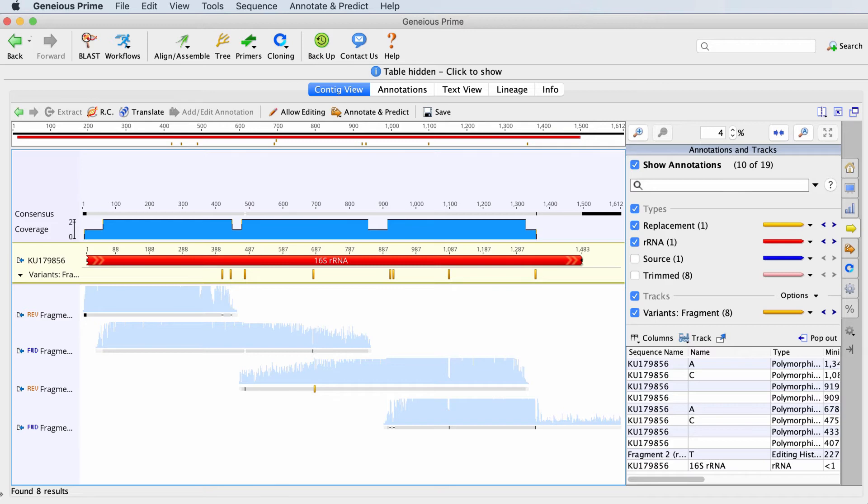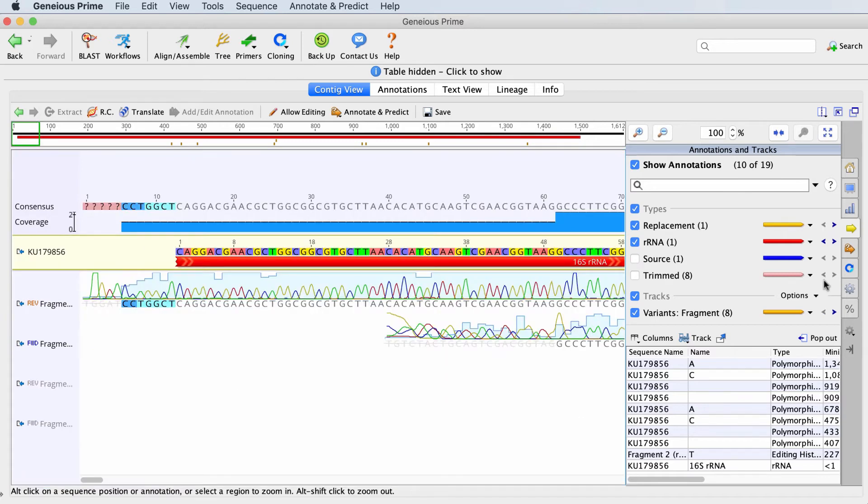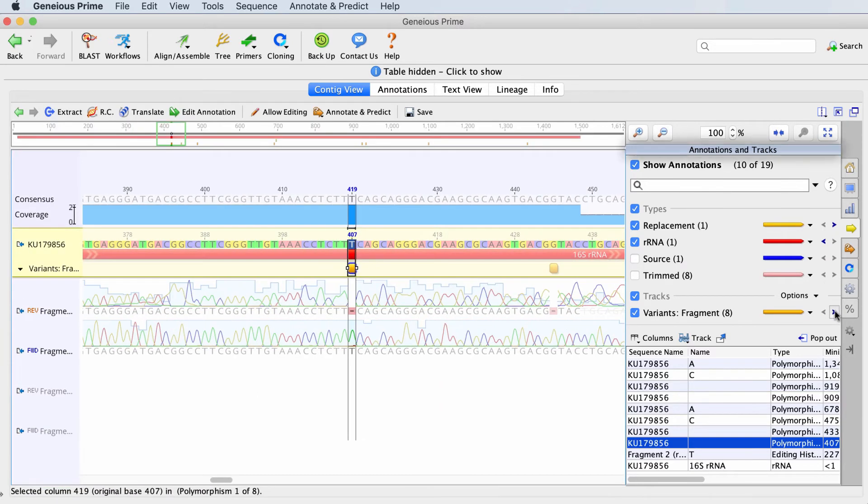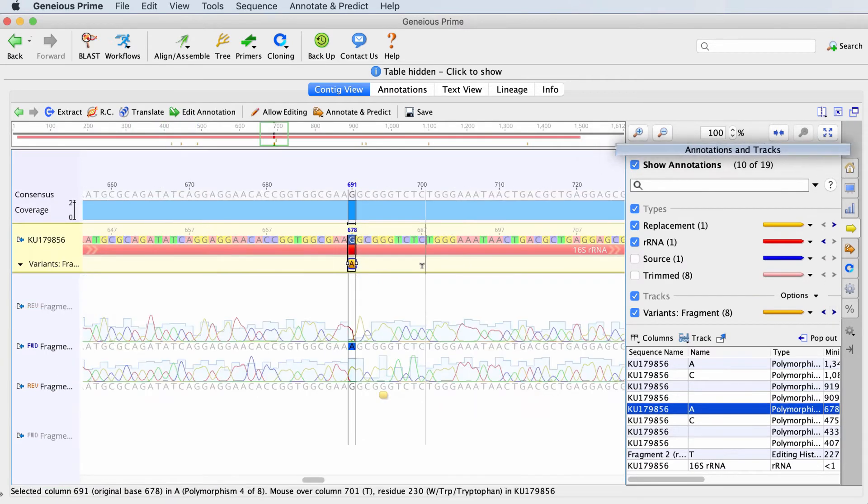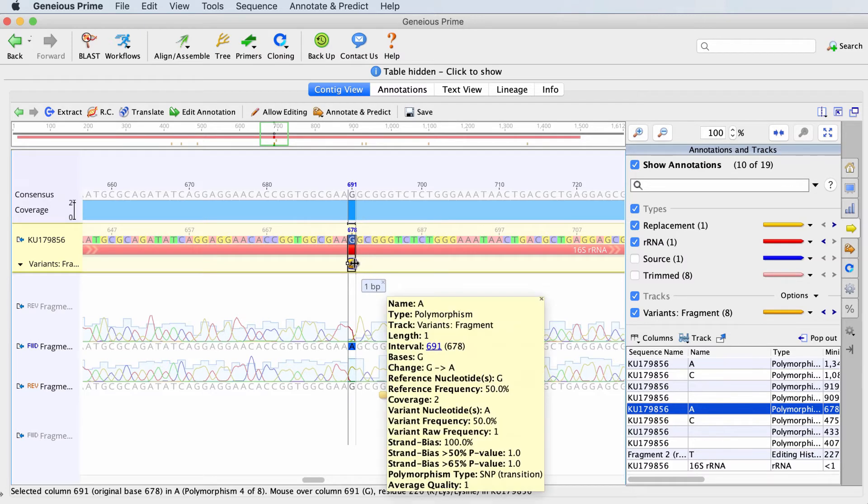You can jump between snips using the arrows in the Annotations and Tracks tab. If you hold your mouse over one of these new annotations, you'll see a pop-up window containing information about that snip.